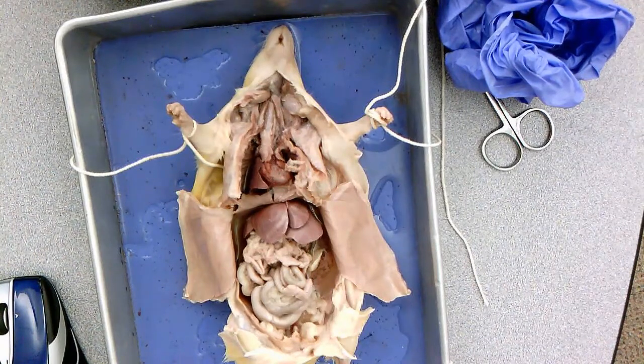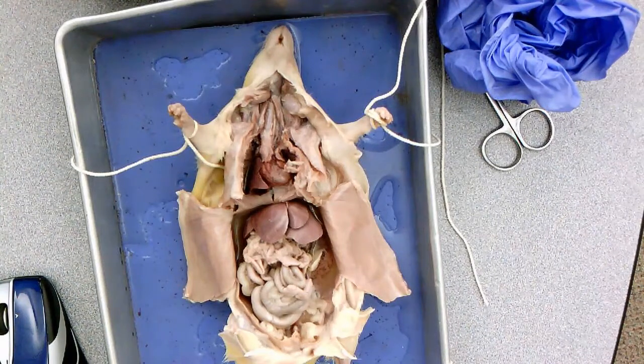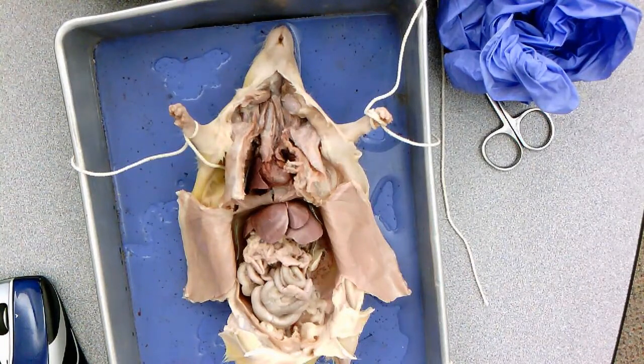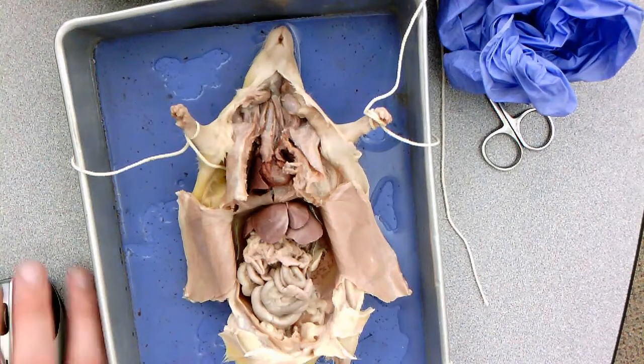Your teacher is going to direct you each day where to put the rats. You're going to put them in a Ziploc bag, put your name on that Ziploc bag, and we'll store them in the refrigerator. Make sure that you're observing lab safety protocol. You have goggles on and your gloves on at all times. Make sure that you're not touching your mouth, your eyes, those types of things as well. Make sure that you're just being clean. When you clean up, wipe down your tables real nice, and get that hand sanitizer on your hands when you are done.